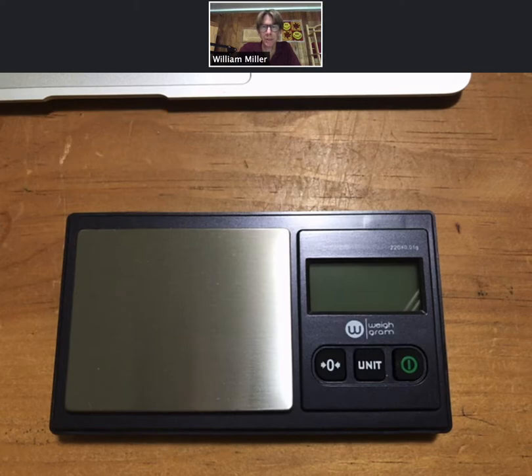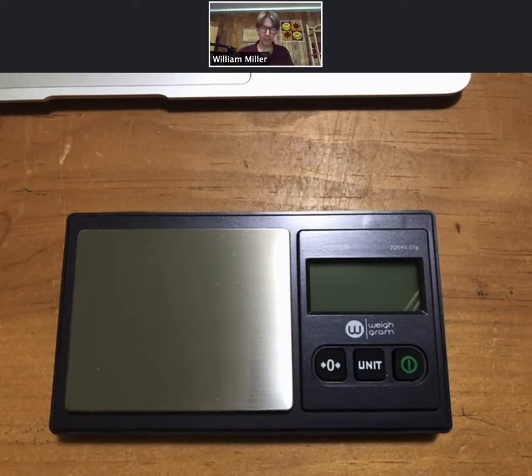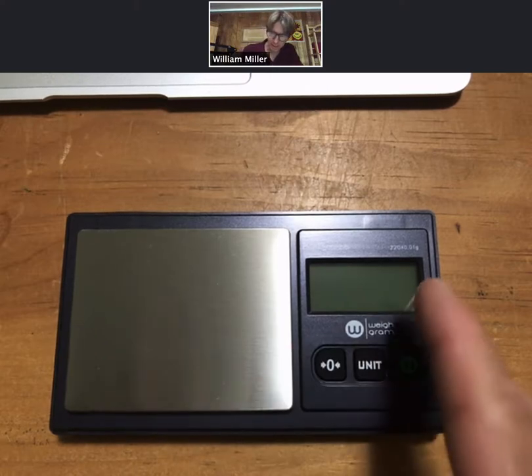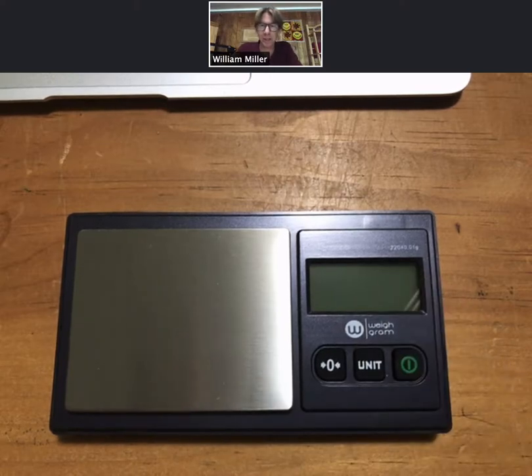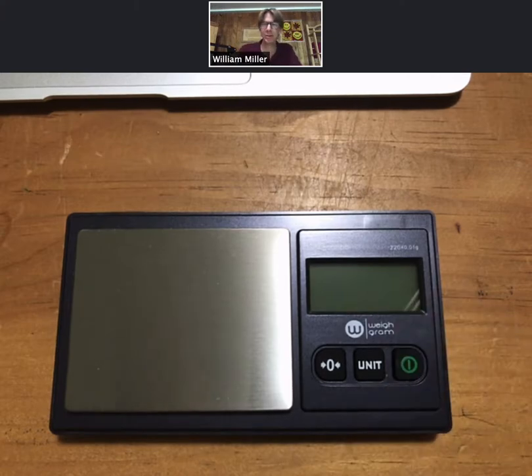This is experiment one on basic techniques: recording mass. A pretty basic function, but important to get it right. I've got my scale here, my jeweler's scale. It has a maximum of 220 grams and it reads down to the 0.01 gram.